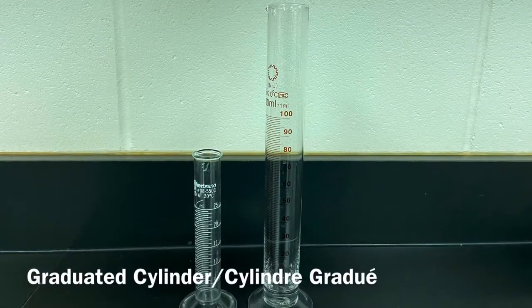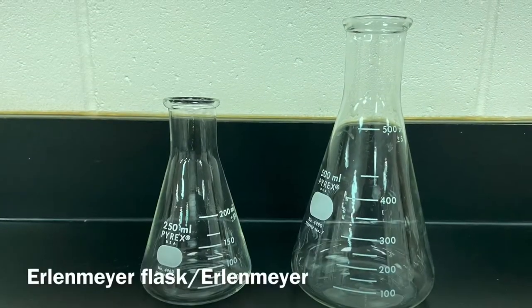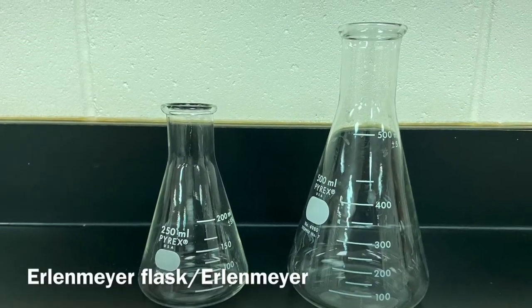Graduated Cylinder. Cylindre gradué. Erlenmeyer Flask. Erlenmeyer.